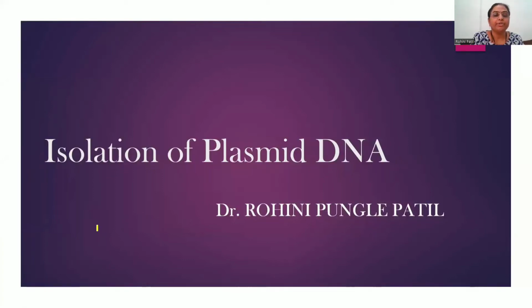Welcome. Today we are going to learn about the isolation of plasmid DNA. Plasmid DNA is also called extrachromosomal genetic material. It is present in the bacterial cell. In the bacterial cell, two types of DNA are present. The first one is plasmid DNA, and the second one is genomic DNA.